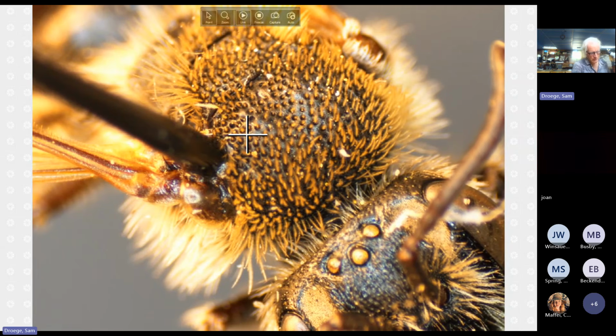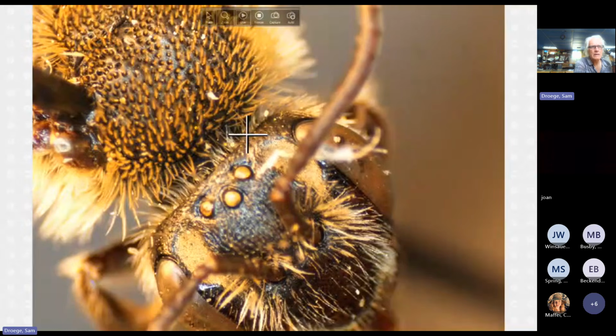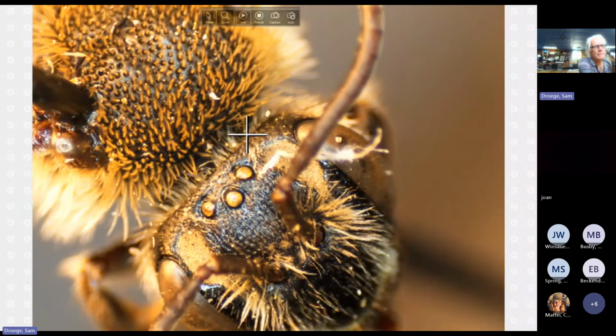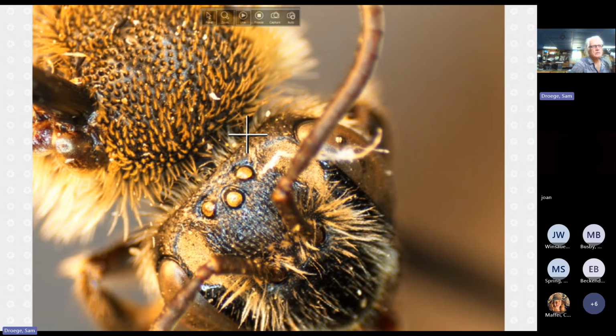So I'm wondering if I have a wrong specimen here, because I'm going to pull another one. That just does not strike me. Am I missing something? They're close, but they should... I mean, my impression is there's too much smooth area in there. So I'm going to put this back on and we'll get another one and see.